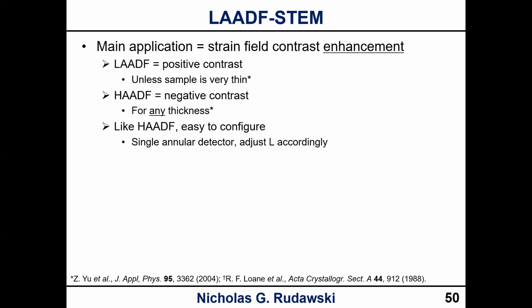Like HAADF, it's very easy to configure. You can use the same annular detector. You just have to increase your camera length accordingly.